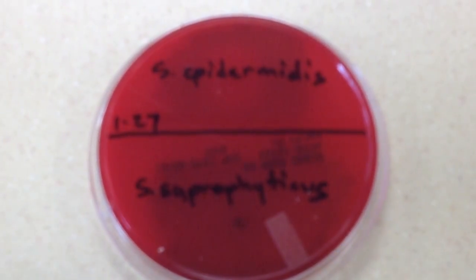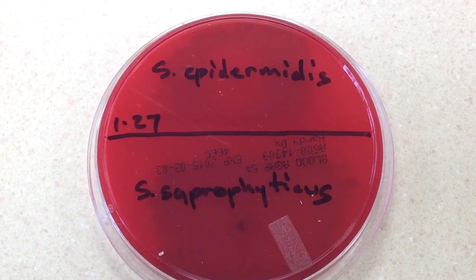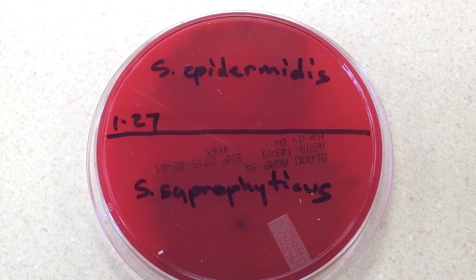In this video, we're going to take a look at the Novobiocin test, which is used to differentiate Staph epidermidis from Staph saprophyticus.